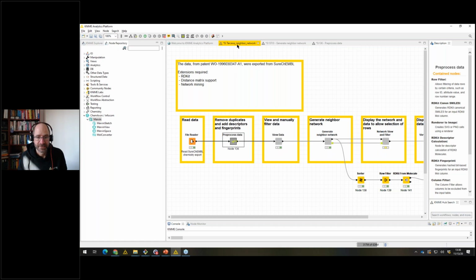So practically on a modern computer, I don't encounter problems with data size in Knime. Knime is good about using the disk if stuff doesn't fit in memory. It really is not a problem.